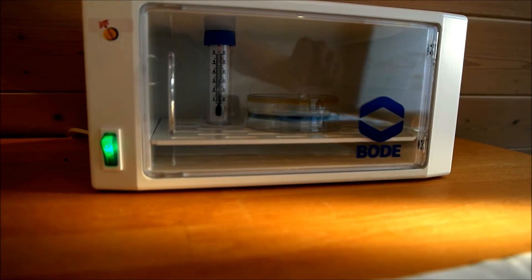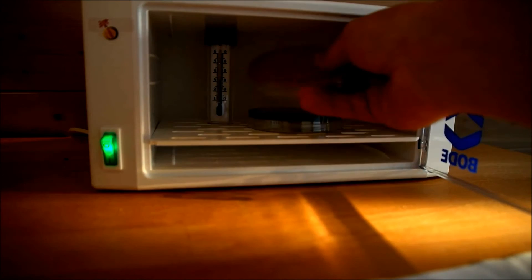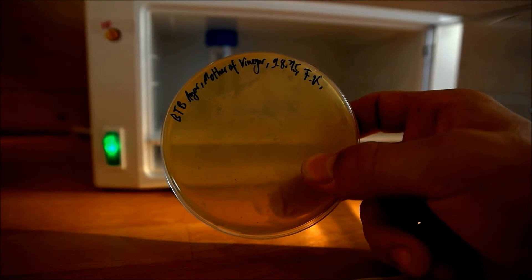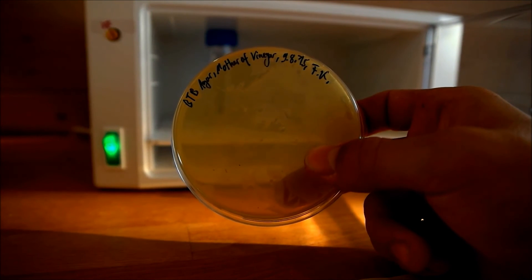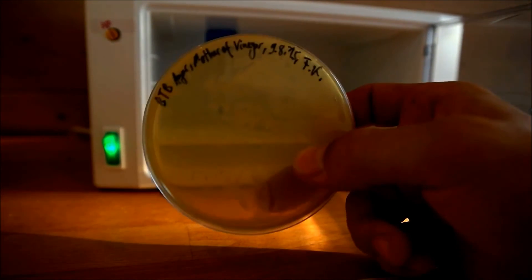The plates were in the incubator for 24 hours now, so let's have a look at them. That's the mother of vinegar plate, and you can see that the whole plate turned yellow. That's because of the growth of Acetobacter which produce acetic acid — the Bromothymol Blue indicator turns yellow.